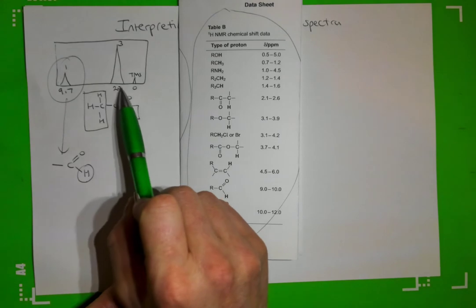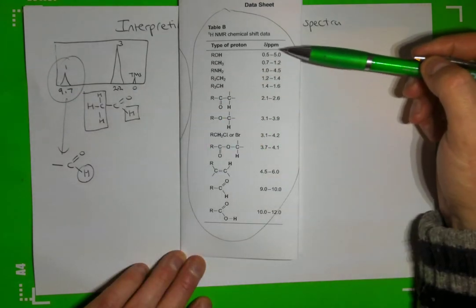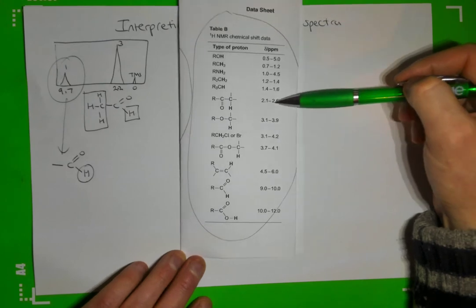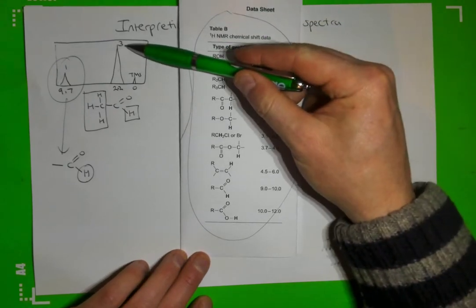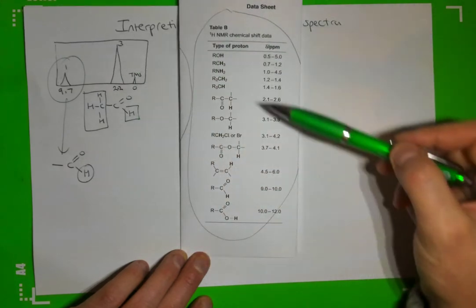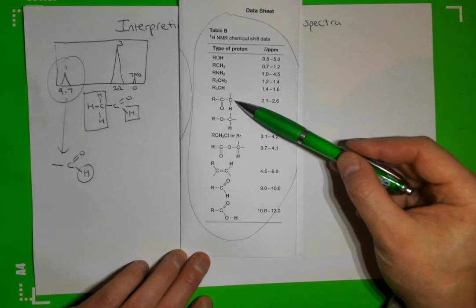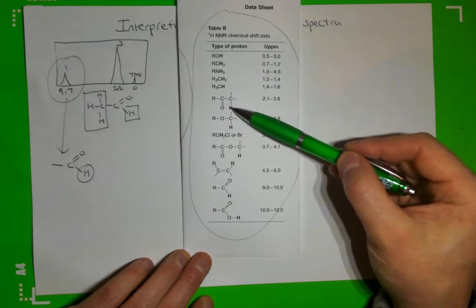And we've got another peak here at 2.2, so we'll find 2.2 in our list. So the only thing it can be is this one here. However, because the integration ratio is 3, there'll be 3 times as many hydrogens as this one. So there must be 3 hydrogens in here. So I'm going to copy it down, but with 3 hydrogens here like this.